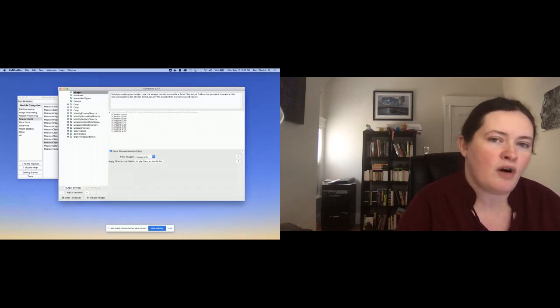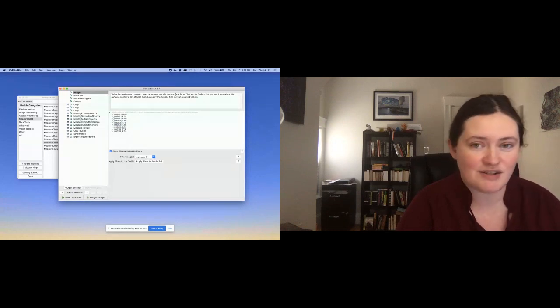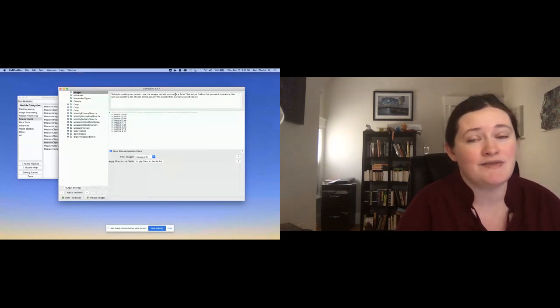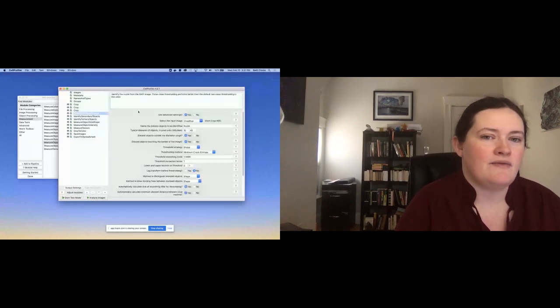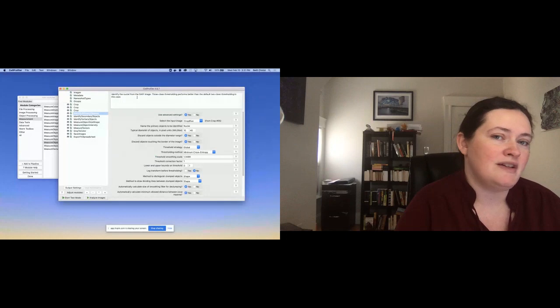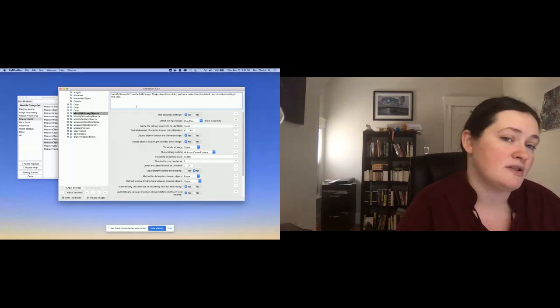What you hopefully will notice are a few things. One of them is at the top of each module is a place to take notes. So you can leave notes to yourself or to whoever uses your pipeline after you about why you may have set certain things the way you have. You can say, for example, that this module is designed to find nuclei from the DAPI image. And that in certain circumstances, if you have a thresholding option that does 3-class thresholding, it does better than 2-class thresholding.